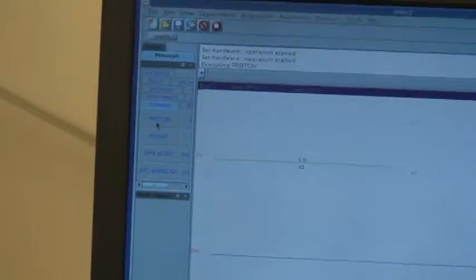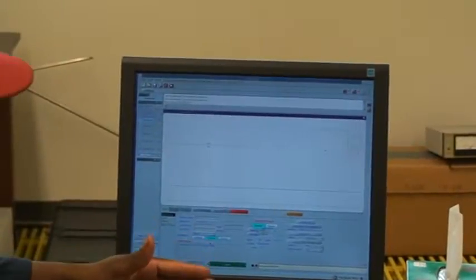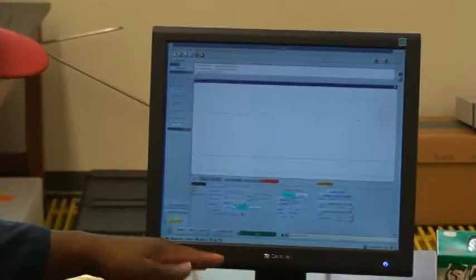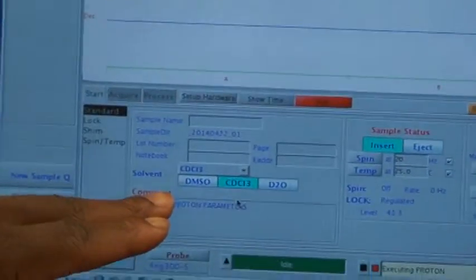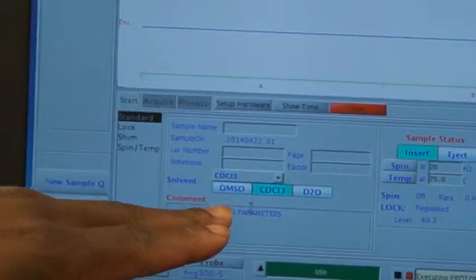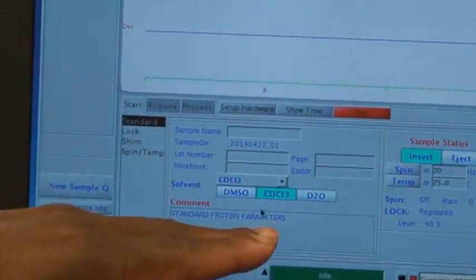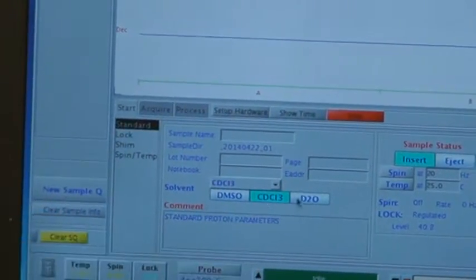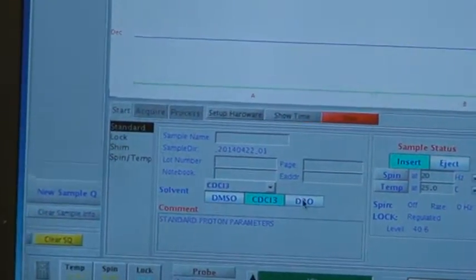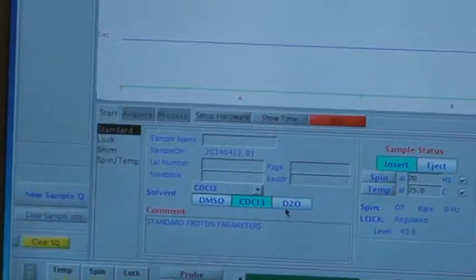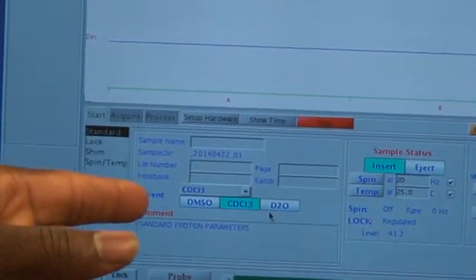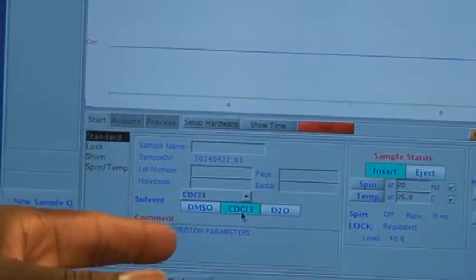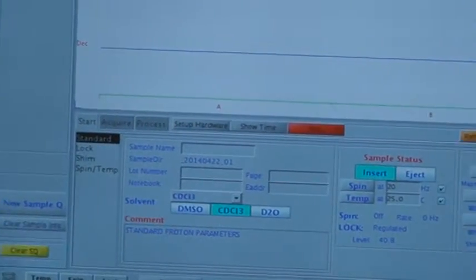After you do that, you can then choose the correct solvent that you're going to be using. On this specific parameters, we have DMSO, chloroform, and also D2O. Today, we're using chloroform, which I already have selected.